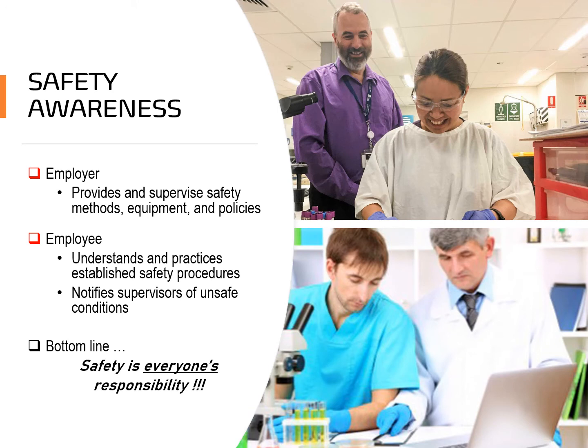For safety awareness, we have two key players here. The first one is the employer, who provides and supervises safety methods, equipment, and policies, and the employee, who understands and practices established safety procedures. The employee also notifies supervisors of unsafe conditions. So these two must work together in order to ensure that everything that is being done inside the laboratory is safe.